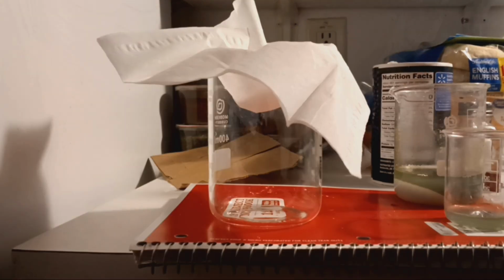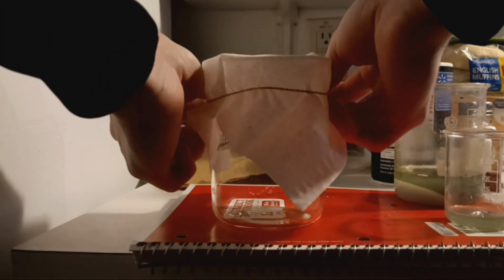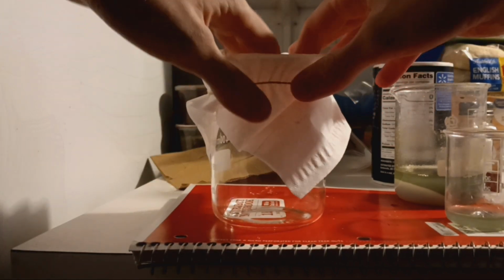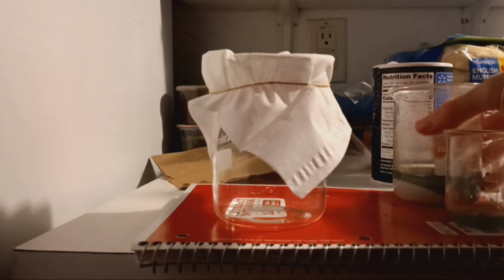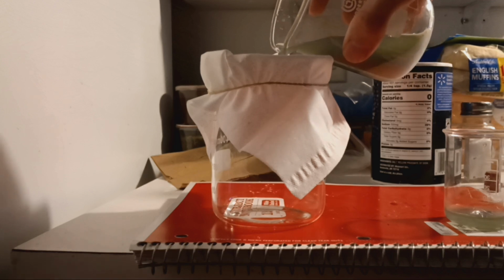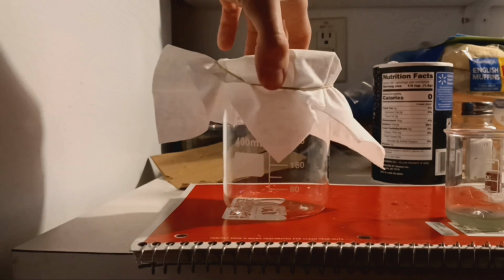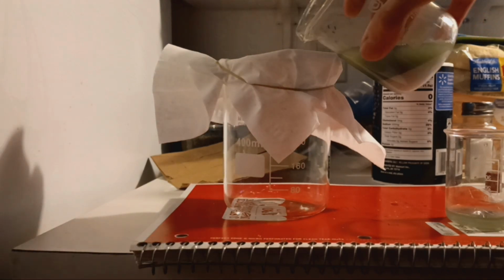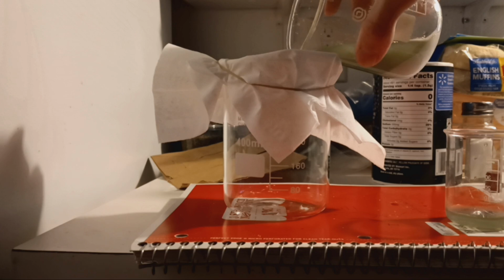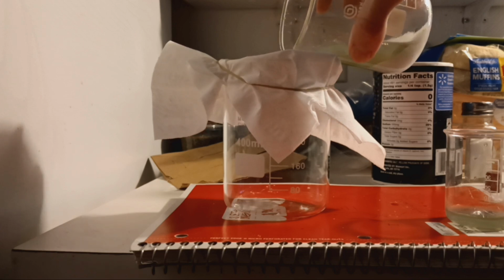One thing I tried to improve this time was filters. I tried many different filters, as I do not have coffee filters. First I tried paper bag. I tried this because when I was a kid, it would always spill my juice pouches at lunch. I also tried paper, because I thought it would just go through the paper. However, I hit a brainwave at the very end, and determined that tissues would work best. And they did in fact work, until they started to absorb my iron oxides and attempted to steal them from me.